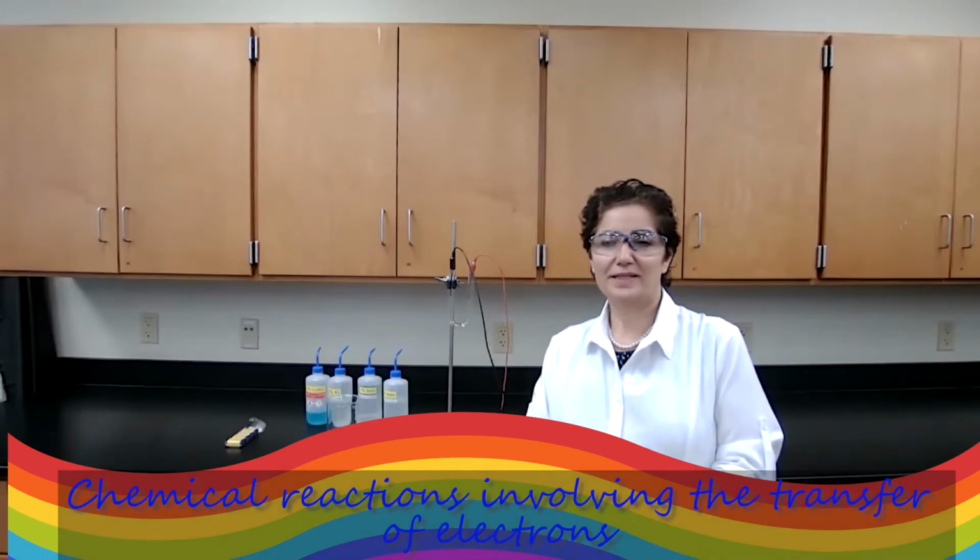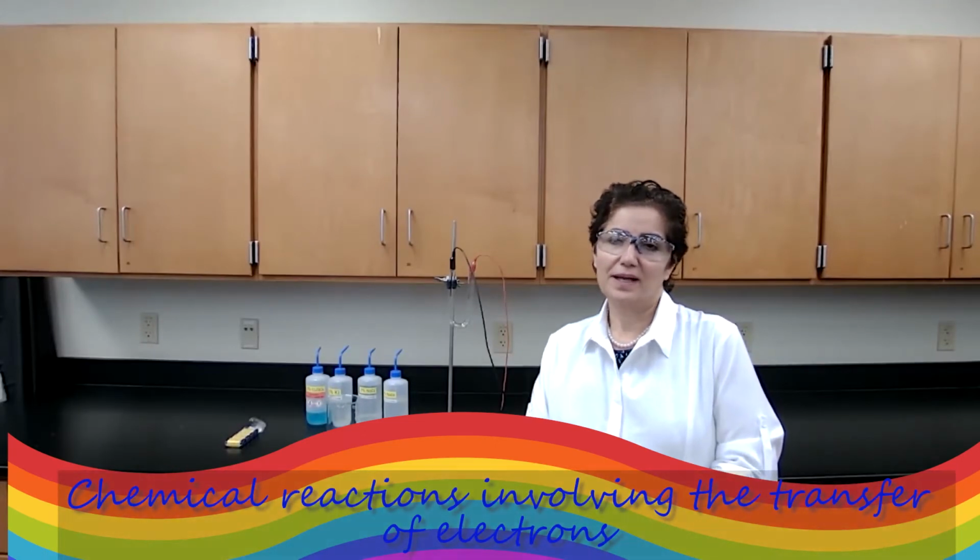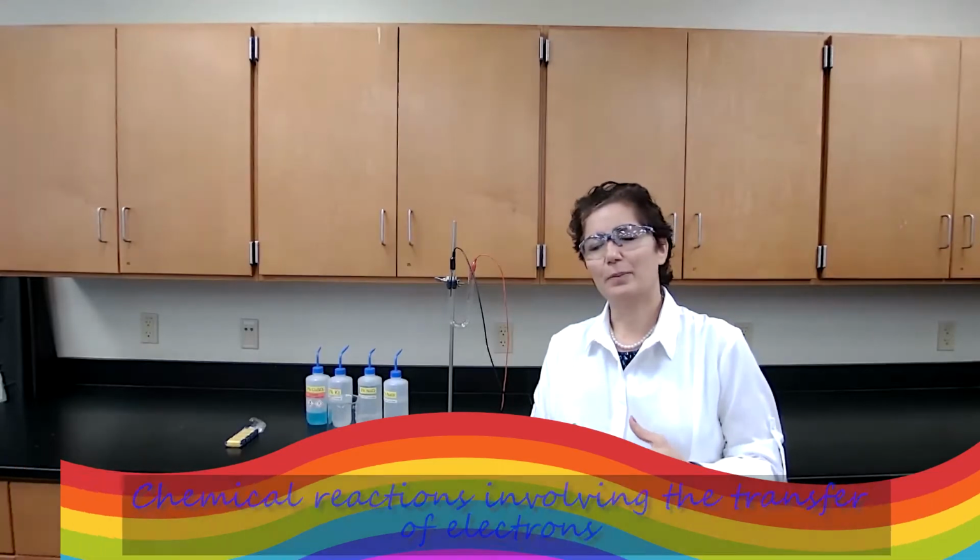Dr. Memari again. The experiment we are covering today is about electrochemistry. Electrochemistry, based on the name, involves electricity and involves chemical reaction. For this experiment, when you review the lab manual, we have two types of approach or two types of experiments that we could do.